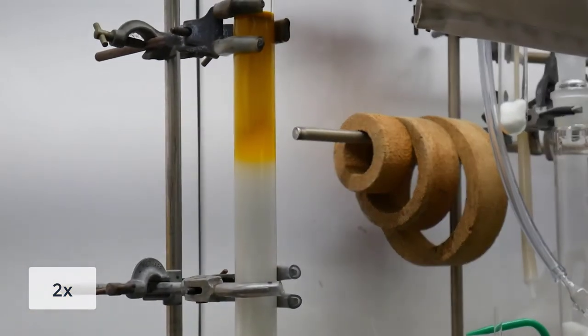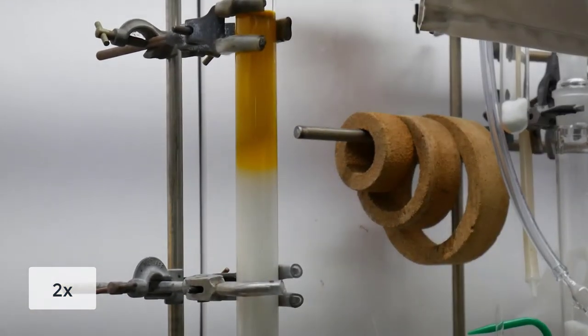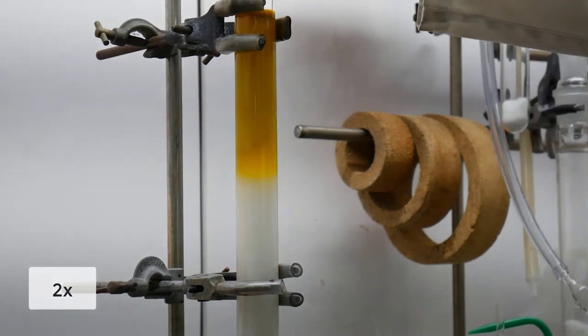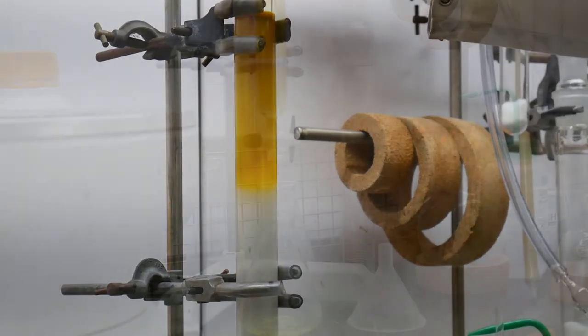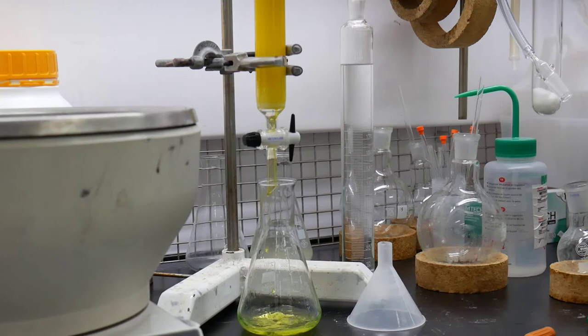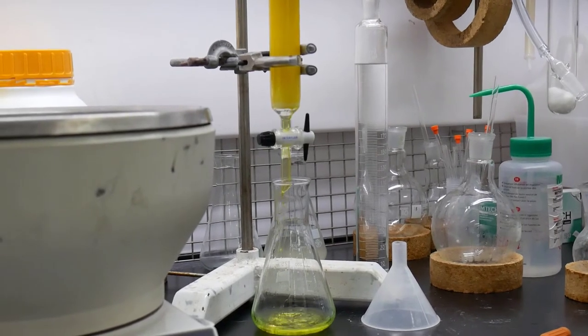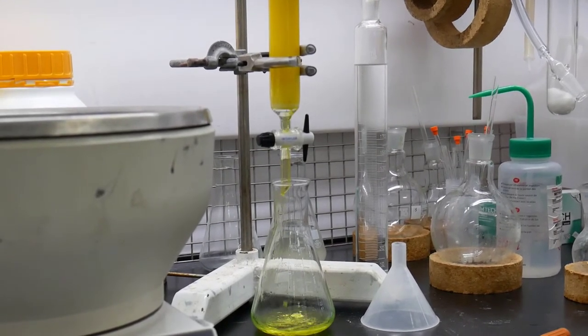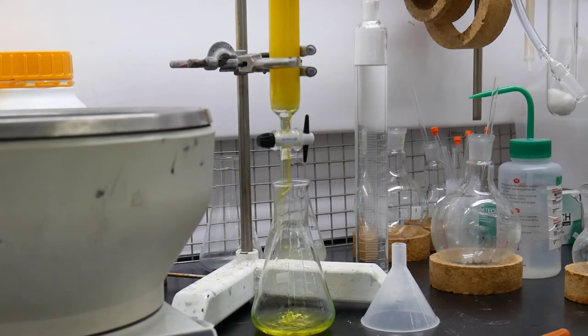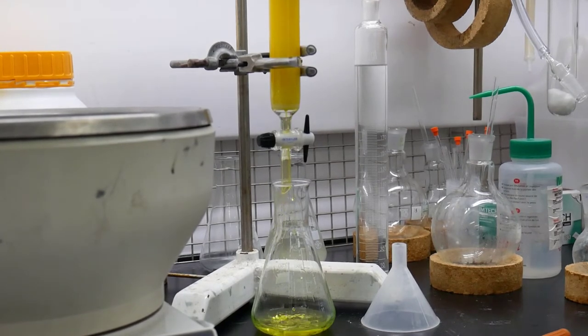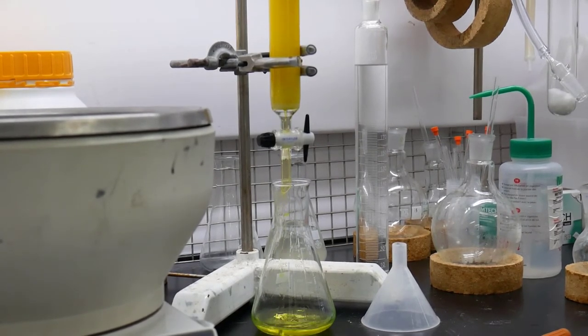Here you can see the yellow is moving slowly through the column and the yellow is the compounds that I desire. Once this compound reaches the bottom of the column it drips out the bottom and I'm able to collect it and remove the solvent to afford my nice clean compound.